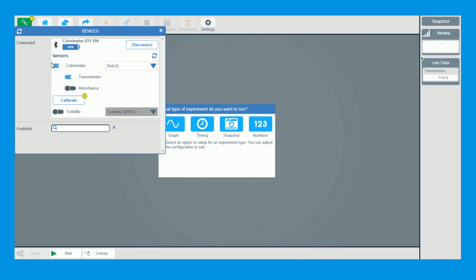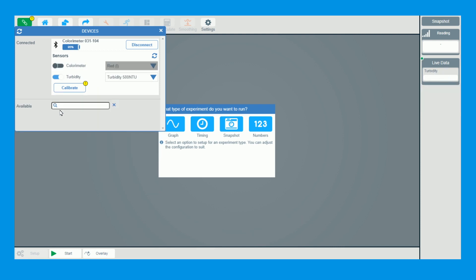We're now connected. You can see the ranges — you've got colorimeter, then you can use transmission or absorbance — but we want to do turbidity. We just click turbidity at the bottom and it turns off the colorimetry, because you can't do both together and there's no reason why you ever would. There are two ranges: 200 and 500. I want to use the 500 range for this experiment today.